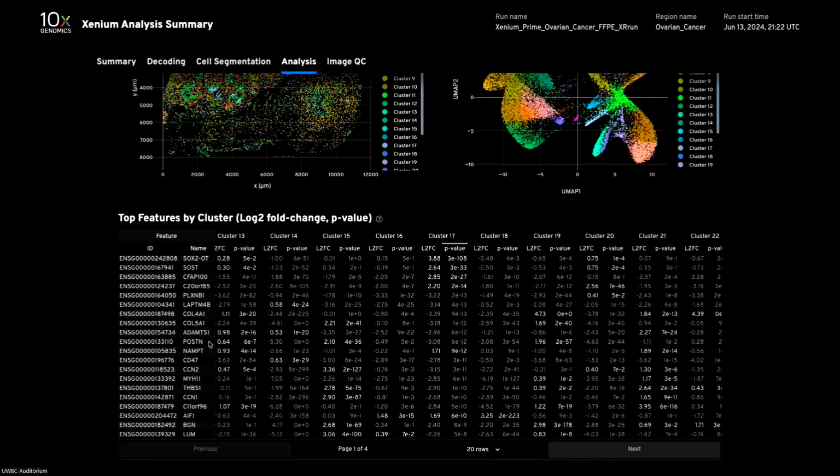Again, this is just an example that shows you how you can start an analysis with those tools. But again, the idea, and I'm hoping that I gave you the idea, is that when you have multiple data sets coming from those three different platforms, you can actually look at those in an integrated fashion and start by single cell. That is what gives you essentially the heterogeneity of the sample. Then Visium gives you the spatial context, and Xenium really helps you dig deeper into the biology and identify those niches. Again, it's a quick example of how you can approach your data analysis.